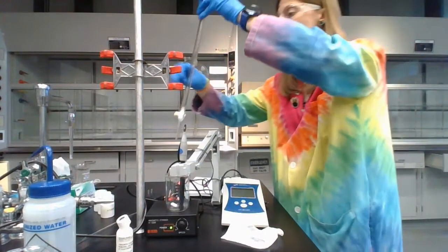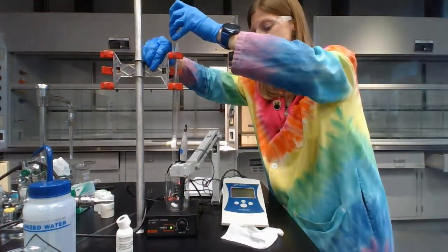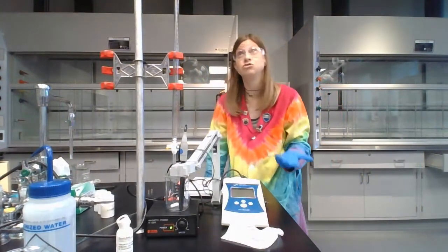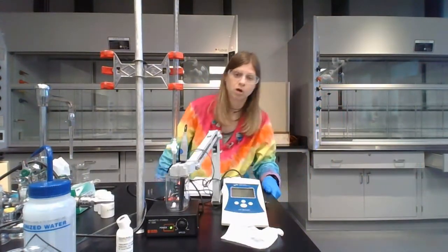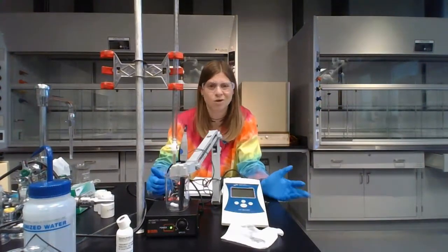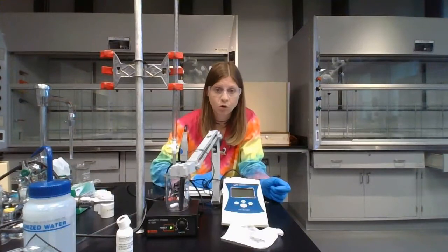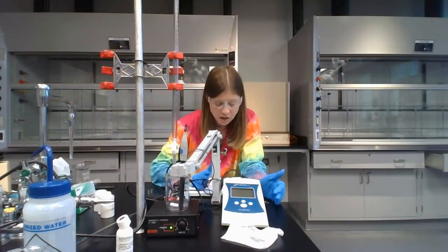Okay, so you're going to use whatever technique feels right to you to add 1 milliliter of sodium hydroxide. Now, let's say you don't stop right at the 1.00 mark. Maybe you overshoot it a little bit, and it's like 1.22 milliliters. Well, then write that down. Accurately record the volume of sodium hydroxide. Your goal is to get 1.00 milliliters, so do the best that you can. But whatever it is, you're going to write that down.